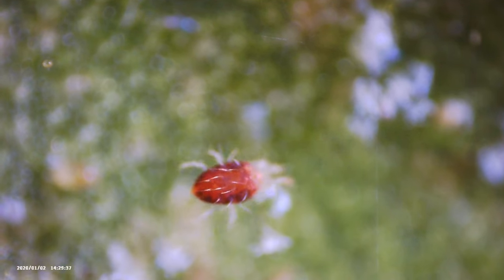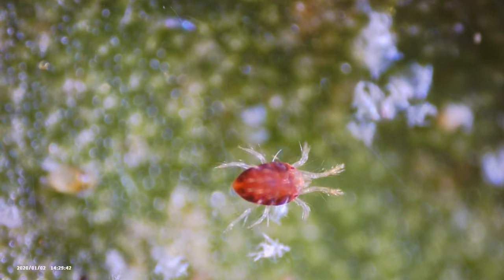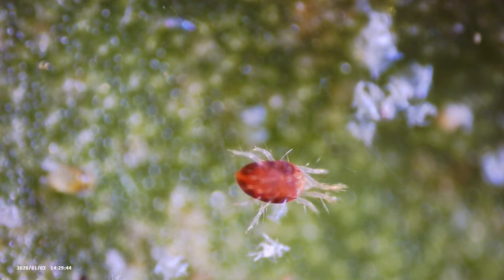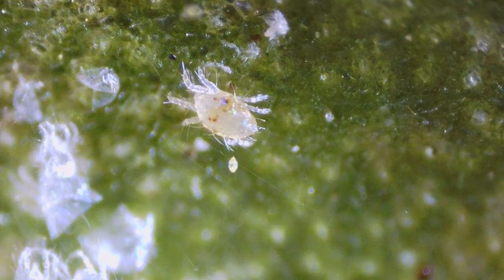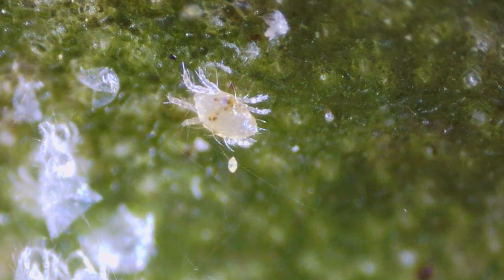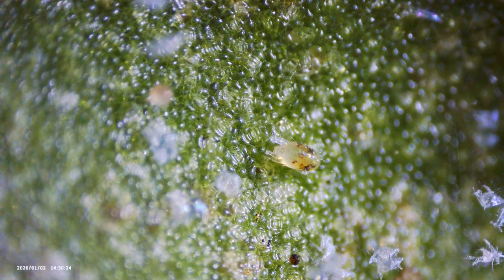You really have to look at the underside of your leaves to find these guys. These pests are often hard to find simply because they're usually under the leaves. It's very rare that I see spider mites crawling around on top of my leaves, so unless you're actively looking for them you might miss them. Usually the only time you'll start to see them on the top of your leaves is when it's far too late and there's a million of them on the underside. Always make sure you check your plants every once in a while.